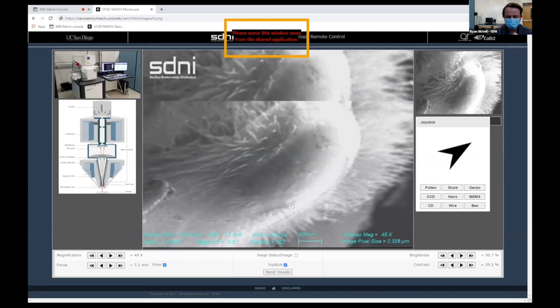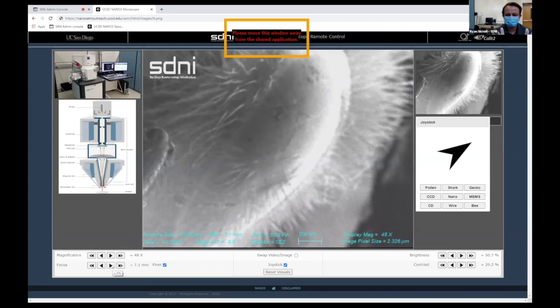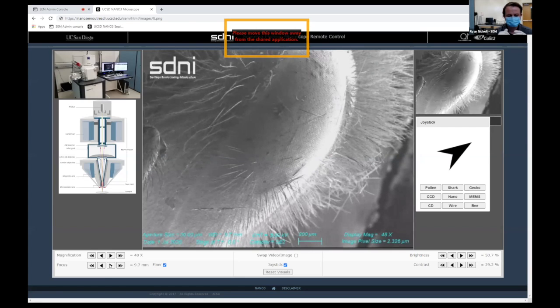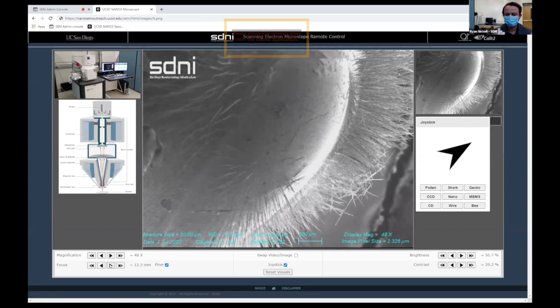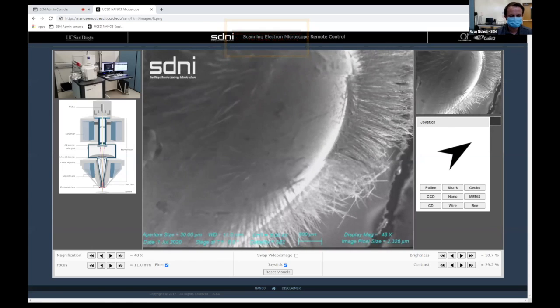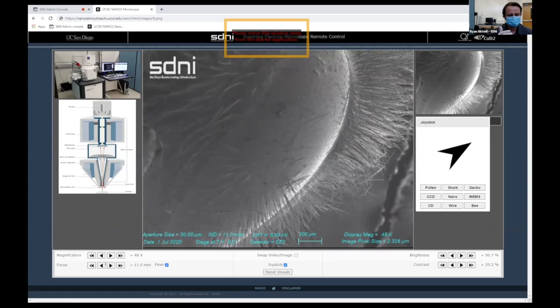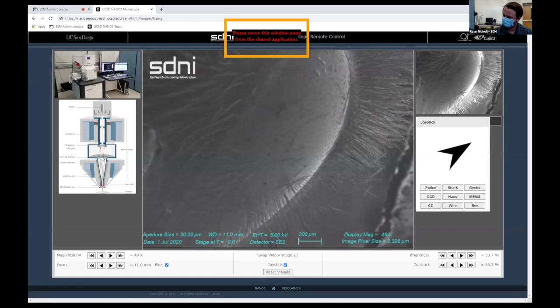Yeah. So there's a whole bunch of different detectors in the system. We've got really dumb detectors, which just say, oh, hey, there's some electrons. There's other detectors which can detect different types of scattered electrons. There's certain parameters that you can be sensitive to. So the detector that we're using now is one of the dumb types. And that's not to say it's not instructive. It just behaves more like you might expect a normal camera. There's shadows that you can see, right? I don't want to get into that too much. It looks like there's perspective in the image.